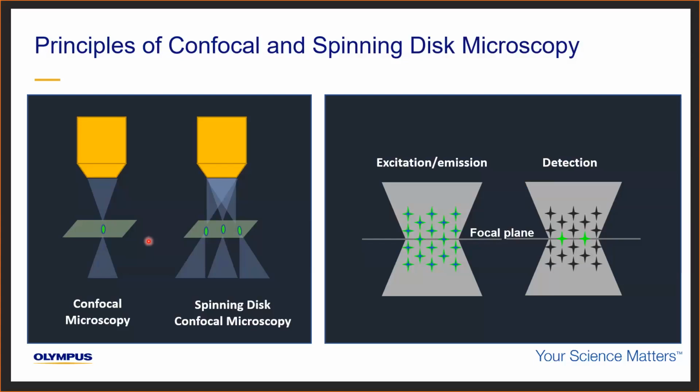Now, the speed of imaging in confocal microscopy can be improved by the presence of resonance scanners or gallium arsenide photomultipliers, or by simply using a spinning disk configuration. However, faster scanning means fewer fluorophores are excited and fewer photons are emitted, so the signal-to-noise ratio is reduced. So confocal microscopy will provide superior Z resolution, but at the cost of speed and excitation efficiency. It will work well for fixed tissue slices of limited thickness and time-lapse imaging of selected areas in living samples. But high-resolution imaging deep into biological tissues is not very efficient.